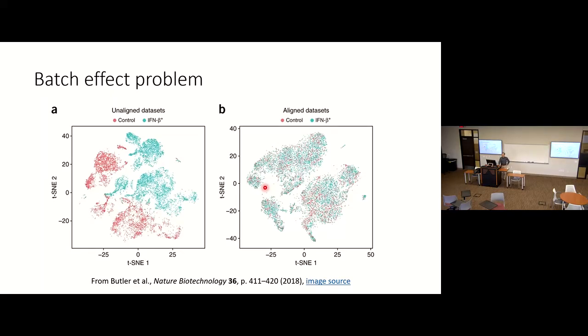Okay, so we always observe these so-called batch effects. Assume you do single-cell RNA-seq on the same population of samples. Once you embed the cells, if there are no batch effects, since you did the same population, they are all in similar states, so those cells will be superimposed onto each other in this low-dimensional embedding figure.